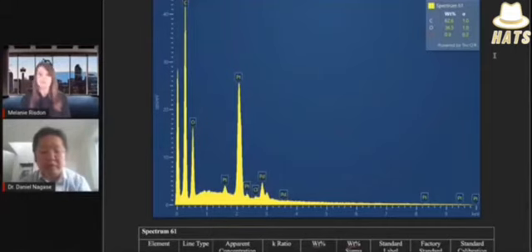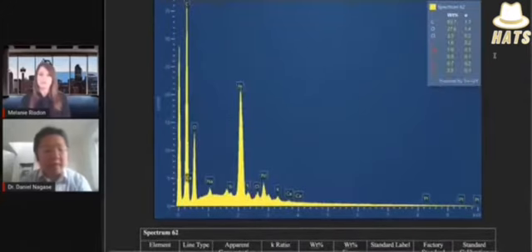And then spectrum 62, same story again. Carbon, oxygen, some silicon, some sulfur, some potassium this time, a bit of calcium, but no nitrogen, no phosphorus. So nothing we saw on that photo was of biologic origin. It appears to be a primarily carbon-oxygen structure.